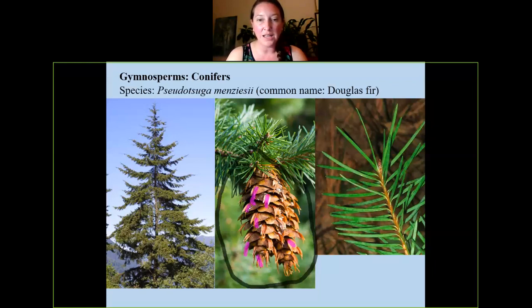And these are actually leaves. So they're brown in this picture because the cone is mature. But Douglas fir is one of the few cones that actually still has leaves visible. If you look at your lab manual, it actually talks about that. Anything else I want you to know about Douglas fir? No. And we call these leaves bracts. I will write it here in case you don't have the lab manual.